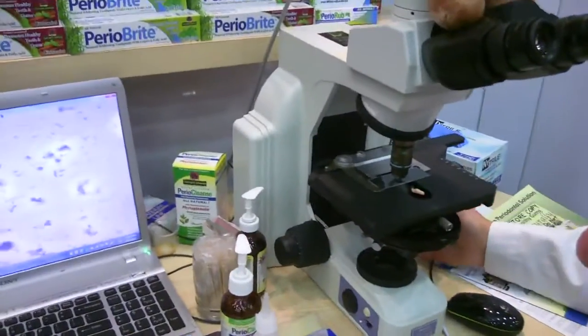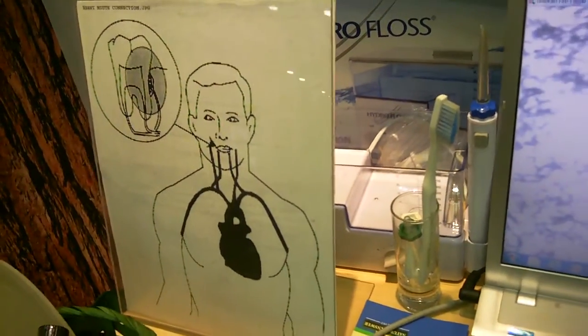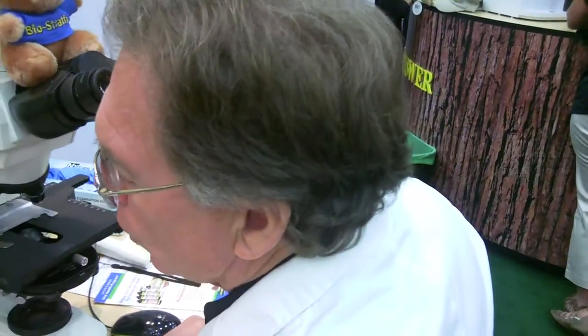It is really an eye-opener about all of this information that is typically not being delivered in the dental profession. I feel that's a mistake — you deserve to know this. These phase contrast microscopes are available in a lot of dental offices, and you can see their value right now because I'm sure this is quite an eye-opener to see all of these spirochetes. You have a number of different species — the long ones, the short ones, the thick ones. Isn't this why a doctor often gives a person an antibiotic if they're a heart patient going to have something done to their teeth? That is a reason to do it, because these bacteria — if you cut on the gums and scrape the teeth to have a cleaning — that is cutting on the gums. So if your mouth is clean and does not have any bacteria in it, you will not have a problem.